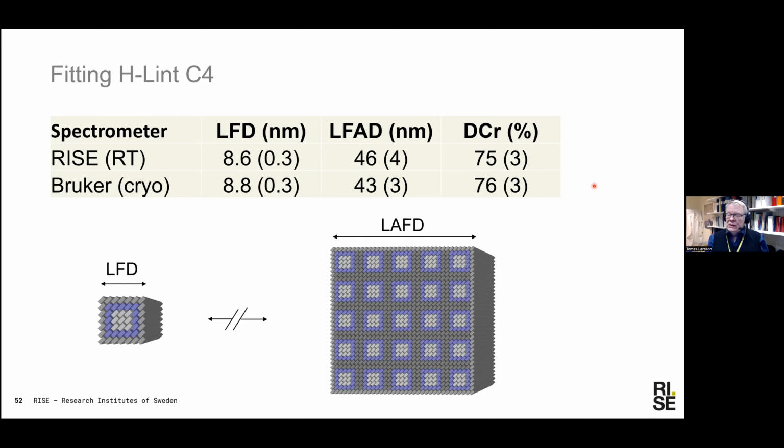And with this decrease in acquisition time, suddenly 2-dimensional NMR in solid state becomes much more doable than on a regular room temperature probe.